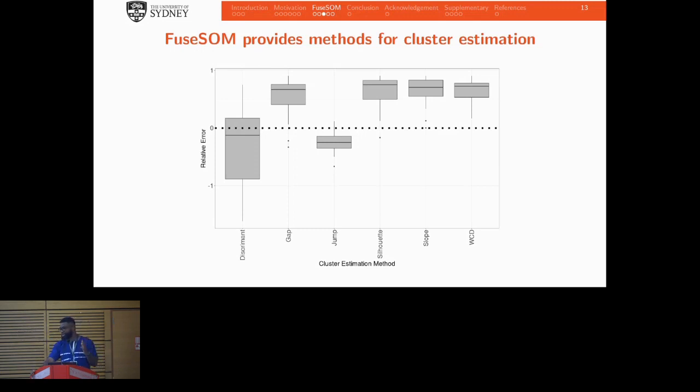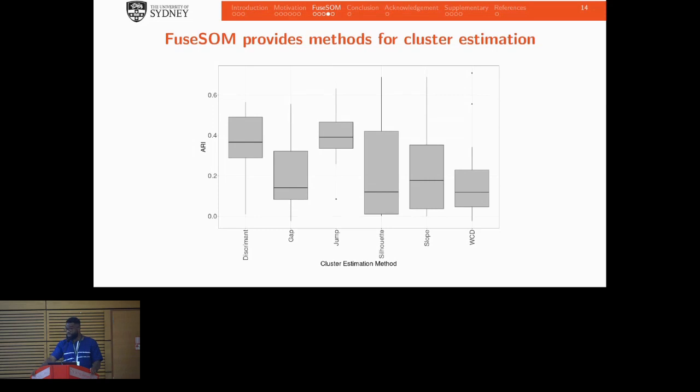Again, you don't have to use it. It's purely a guideline. And if you do decide to use it, it performs decently well at capturing the cell types again. So if you just plug in your data set, say I don't know how many clusters there are, but I want to estimate it, and using those, how well do I recapitulate the actual scores? And you get something like that.